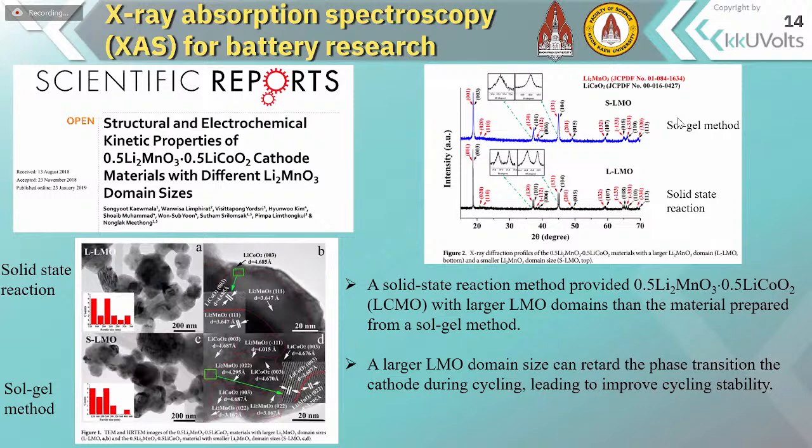The X-ray diffraction results show that the cathode material obtained from the solid state reaction exhibits a larger phase separation than the cathode material obtained from the sol-gel method.